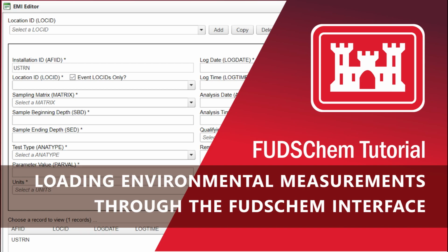This video will go over how to enter environmental measurement data into FUDSChem using the interface. This includes tests such as dissolved oxygen, temperature, specific conductivity, and pH.